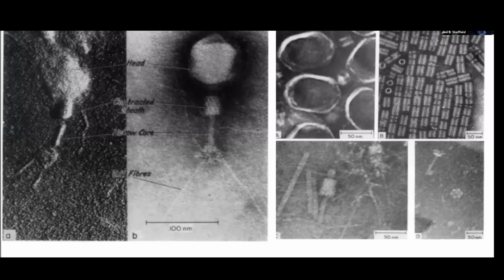All right. One of the kind of profound uses of negative stain was to look at some of the more involved viruses. A lot of the animal viruses are, in a certain sense, boring. Even coronavirus. I mean, it's basically a spiky membrane.